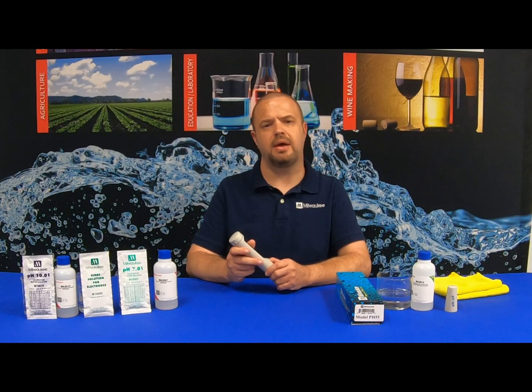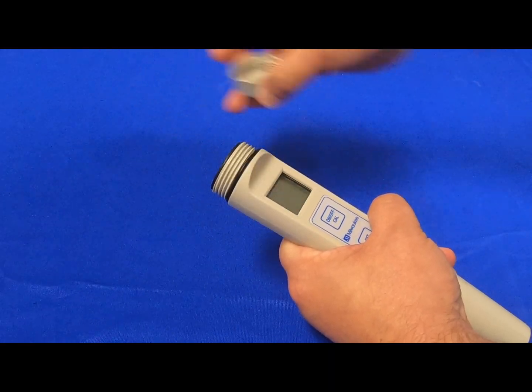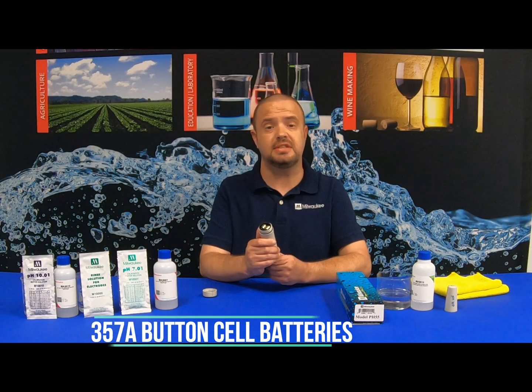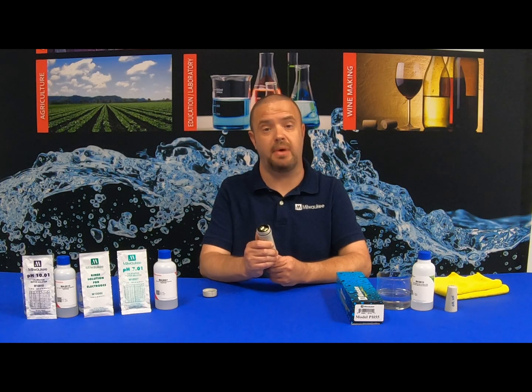When replacing the batteries inside the Milwaukee Instruments PH55 unit, simply unscrew the top of the unit. There are four batteries located on the inside. Take these out and replace them with four 357A button cell batteries. Make sure to follow the correct polarity markings when replacing the batteries.